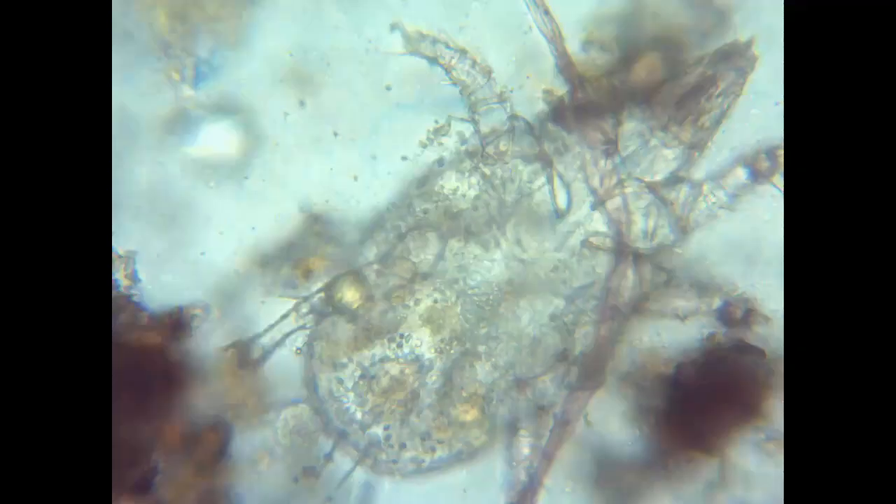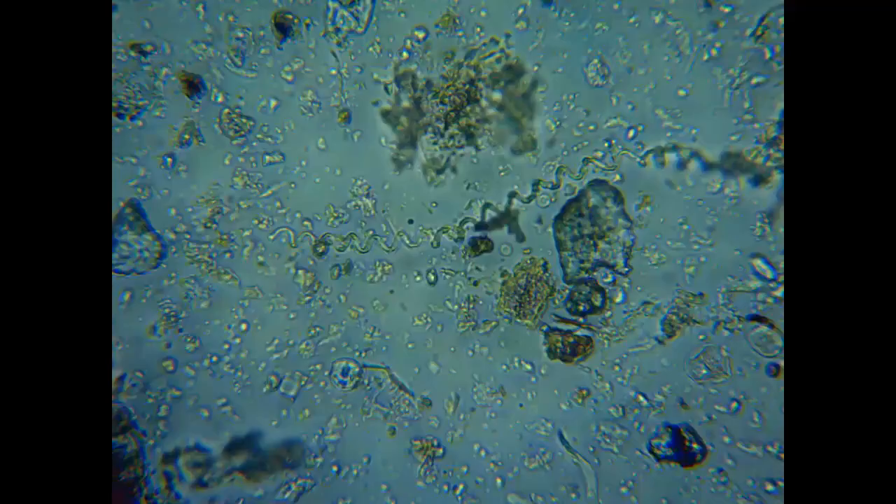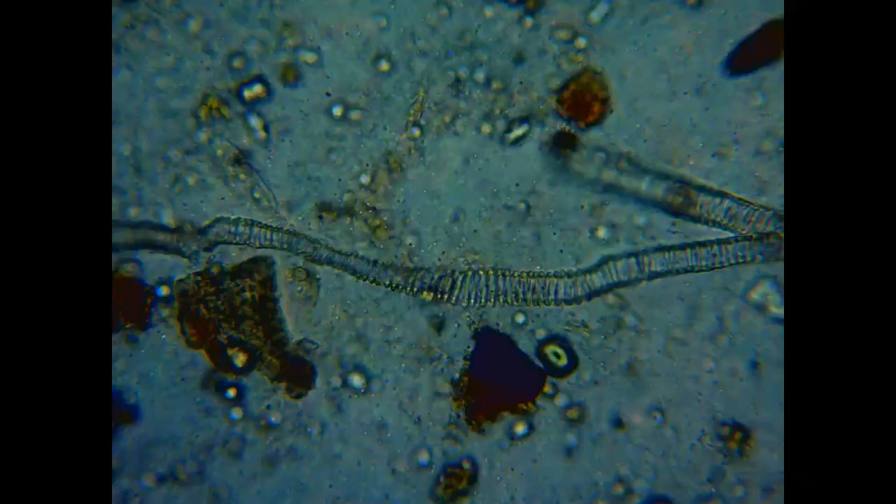You're going to find all sorts of other objects when you look under the microscope, and even after years of doing this there are still things I cannot identify. Two worth pointing out are more common and kind of fun. Sometimes you'll see a microarthropod — they look like a little tiny mite, and I always find them cool because they move around like little mini-Godzillas walking through the soil. Another common object is cellulose, which looks like springs — gigantic springs, sometimes coiled tight and sometimes spread out. But that's all it is: just cellulose.